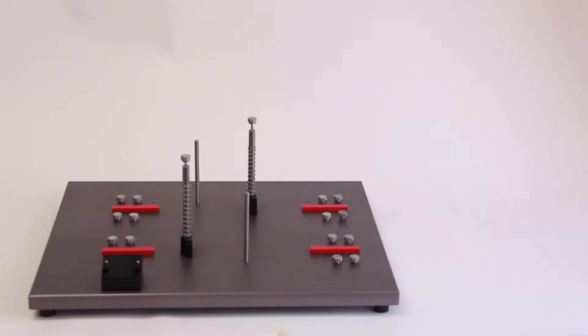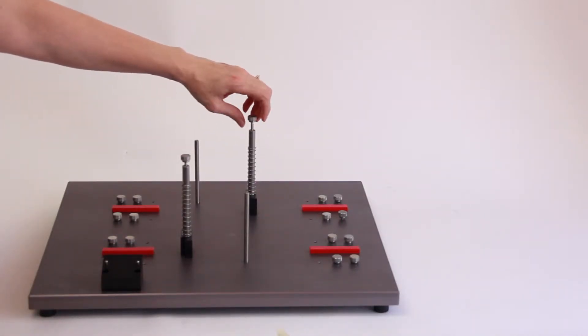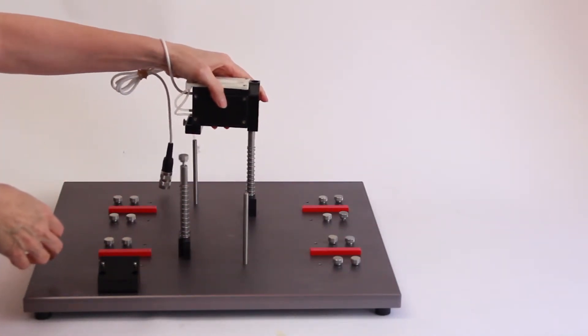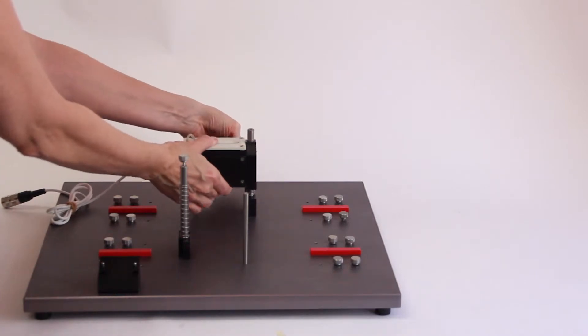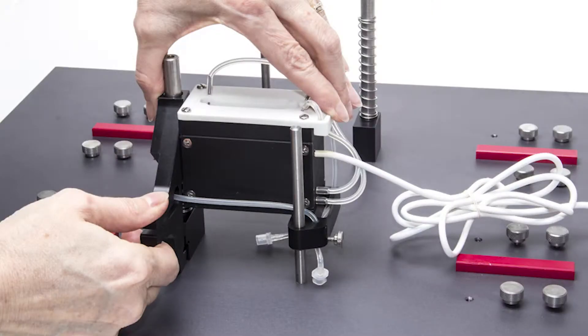After installing the mounting posts, carefully set the base plate down on a flat surface with the calibration stand — which is the front of the base plate — facing you. Remove the thumb screw on the upright cuvette mounting post. Align the cuvette with the upright mounting post and the pseudo-cuvette post. Slide the cuvette over the two mounting posts and into position. Pinch the cuvette latch together with one hand and gently press down with the other hand.